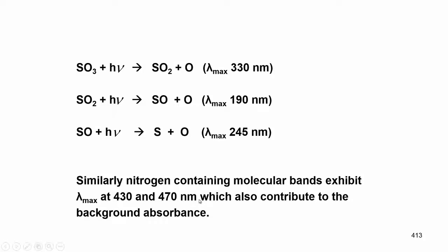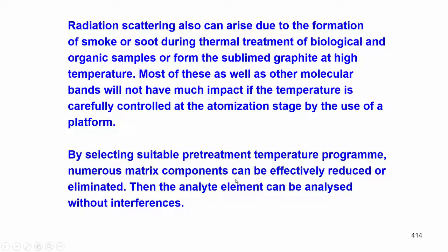They also contribute to the background absorbance. You remember that in all atomic absorption, background absorbance must be subtracted from the sample to get the true analysis.